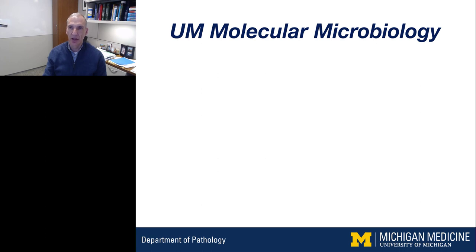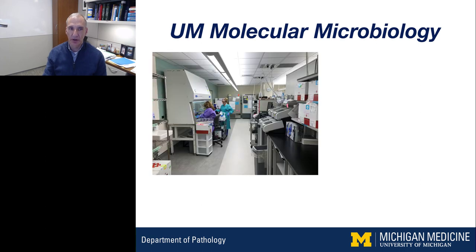So a little bit about our laboratory. We're a large academic medical center. We have a 24/7 core lab and an offsite main lab, which is where I'm located today. We have about 20 staff, 10 that are dedicated to the molecular section and 10 that rotate from our main microbiology lab and perform molecular testing.